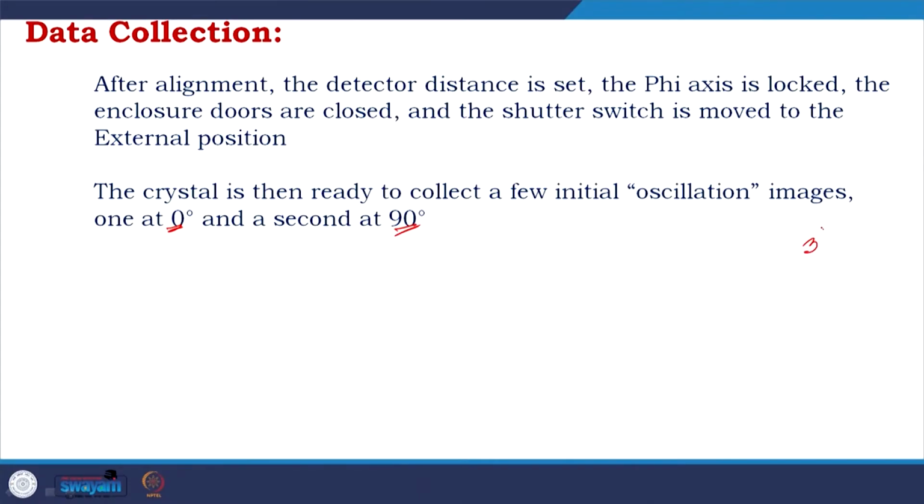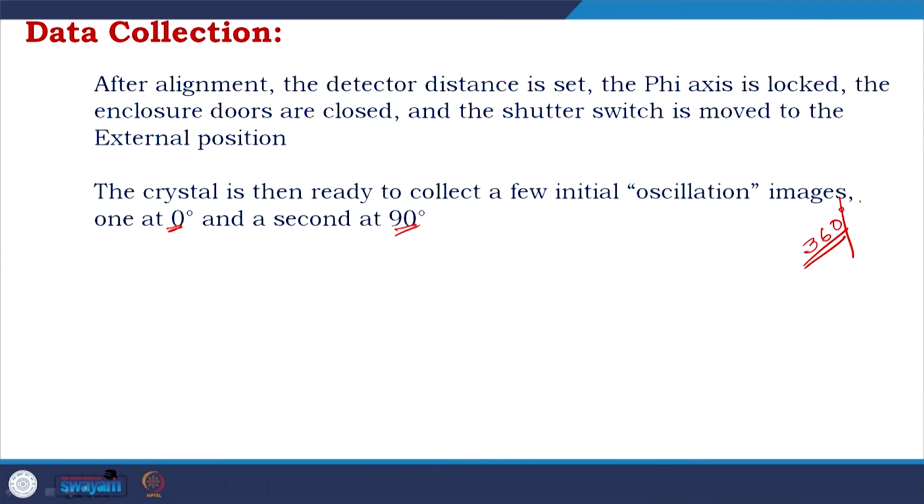Think about if you want to collect 360 degrees of images. So, 360 images at one degree each. If you choose 1 minute, that is 6 hours.